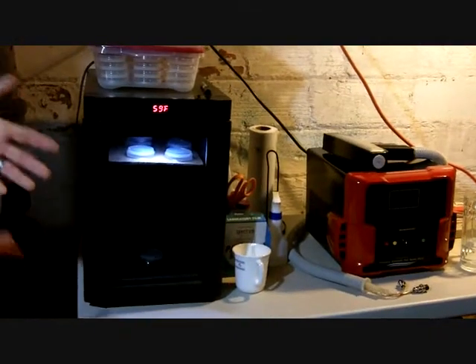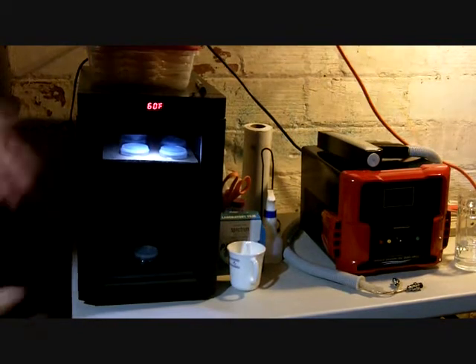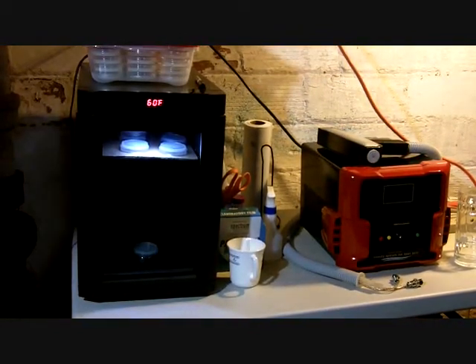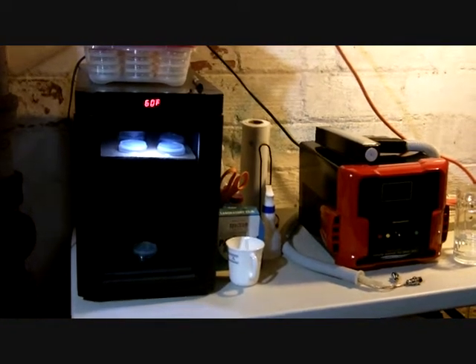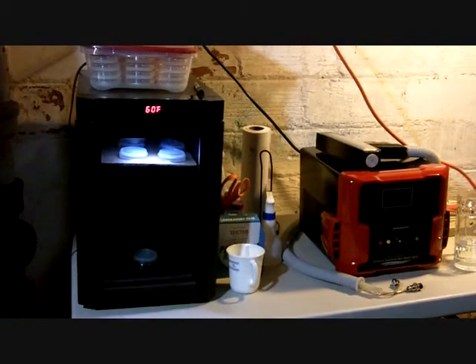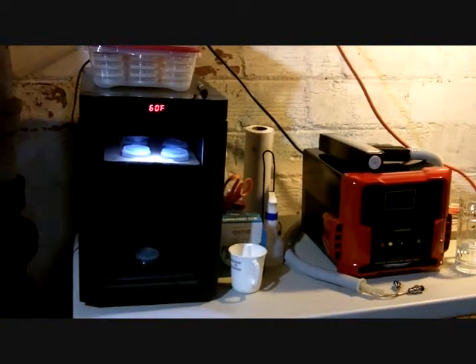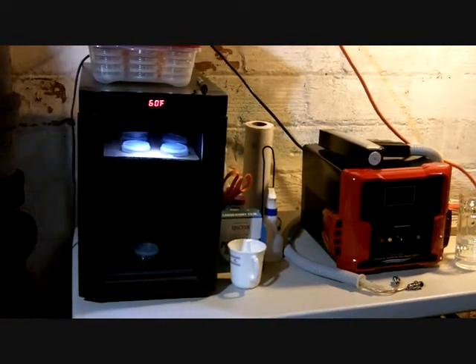Well, that's great. And now let's take a look at some of the equipment that Nason will be using down here in the lab. And what we have here is where Nason is going to be culturing the worms. We've got a little refrigerator here, standard lab refrigerator, I take it? No, it's near room temperature. That's the tricky part. You need one that can maintain refrigeration at close to room temperatures. Your household fridge probably won't be able to maintain a consistent 60 degrees because it's too close to room temperature.